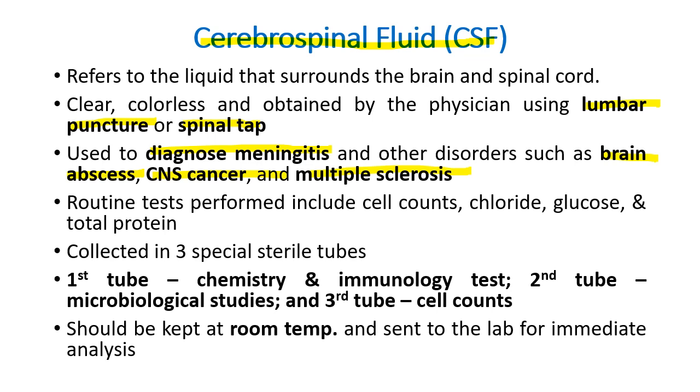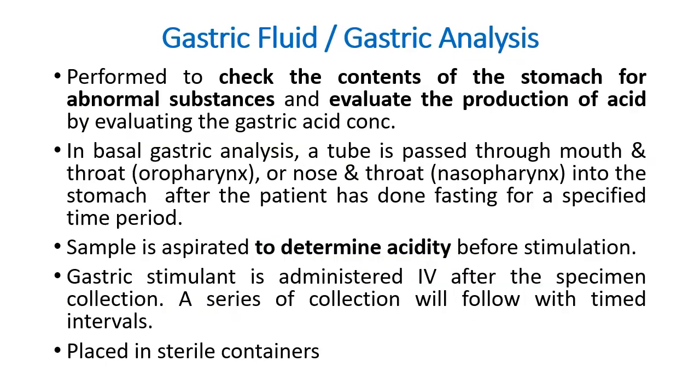So, collected in 3 special sterile tubes. Ang una, saan dinadala yung tube? Sa chemistry and immunology test. Yung second tube ay sa microbiological studies. And third tube ay sa cell count. Saan tong cell count? Sa hematology. Tapos dapat nasa room temp lang yung specimen.